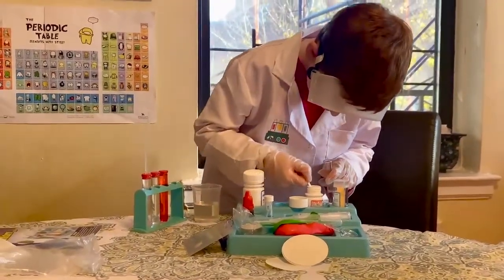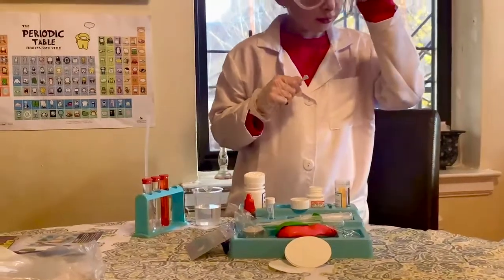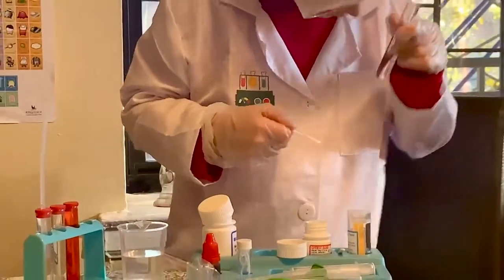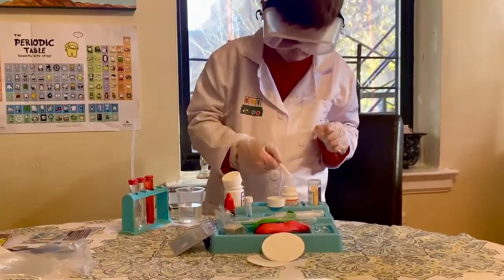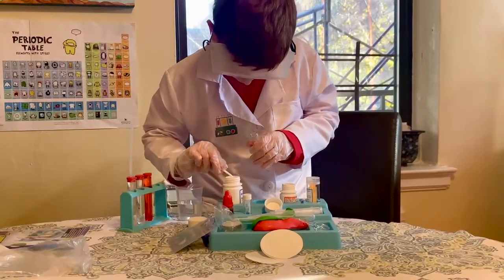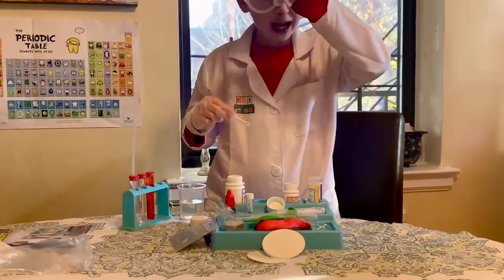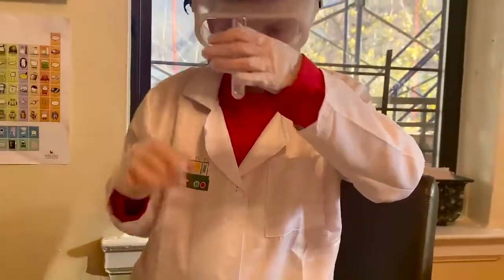I didn't get anything. What's the solubility? All the things went to the bottom. Let's see what happens. Look at what's happening. What's going on? Look at the water. Let me see if I can get closer to see. It's changing. Is it getting bubbly or something? Yes, it's bubbling up with sodium bicarbonate.